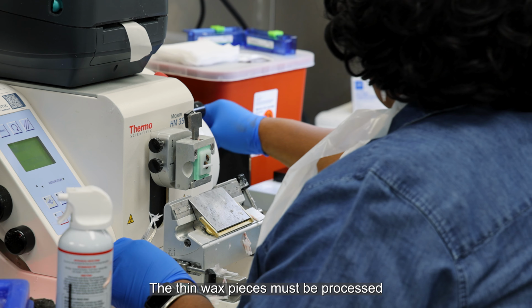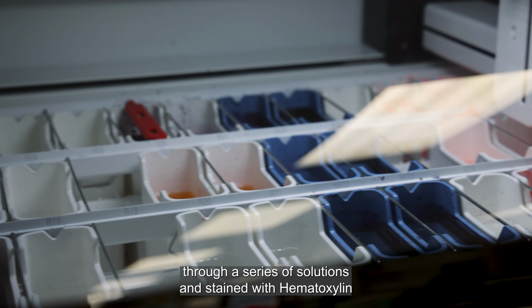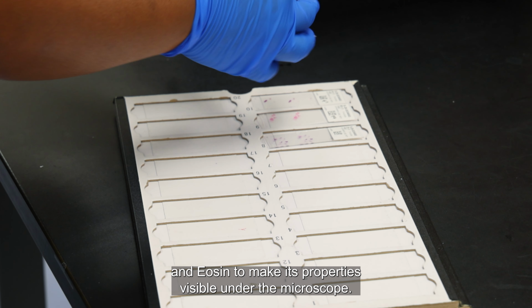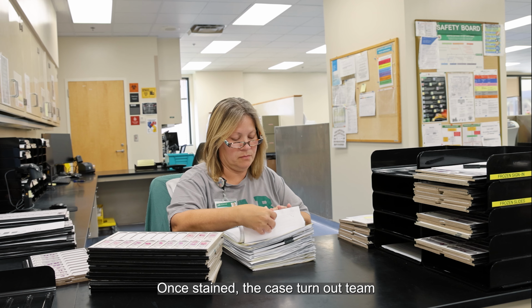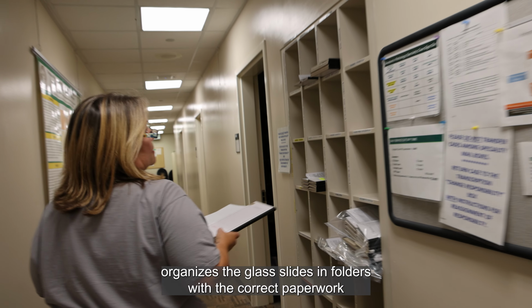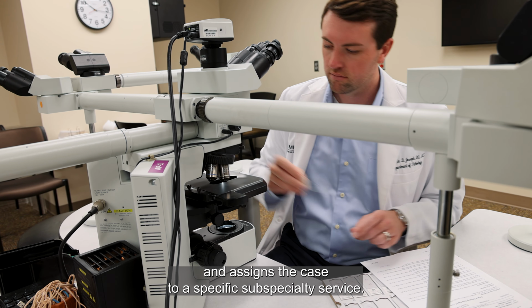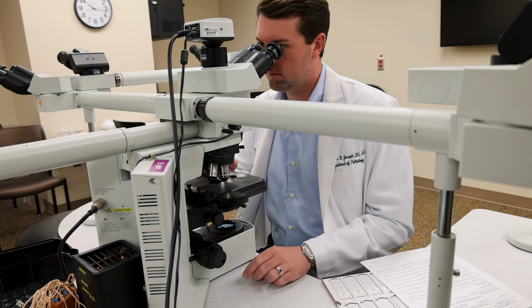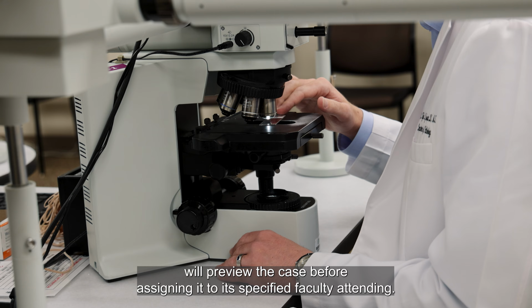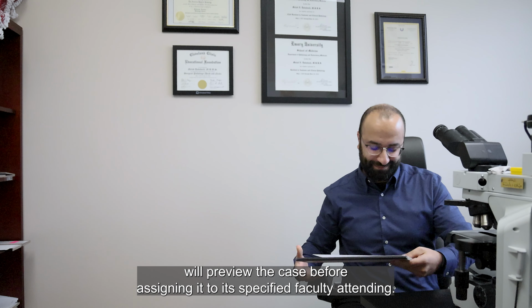The thin wax pieces must be processed through a series of solutions and stained with hematoxylin and eosin to make its properties visible under the microscope. Once stained, the case turnout team organizes the glass slides in folders with the correct paperwork and assigns the case to a specific subspecialty service. A trainee in that subspecialty rotation will preview the case before assigning it to its specified faculty attending.